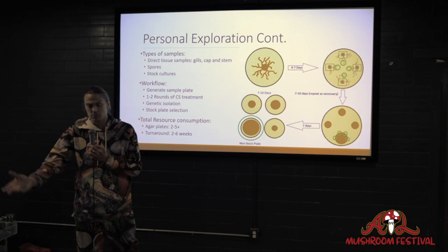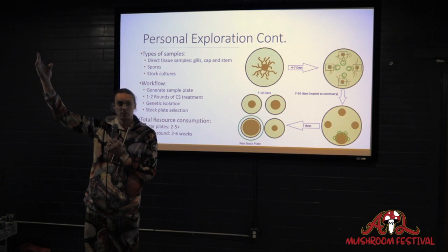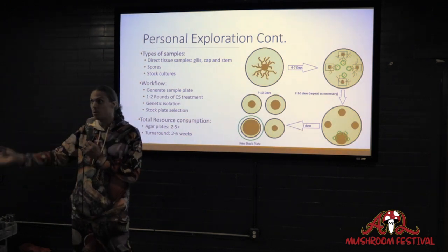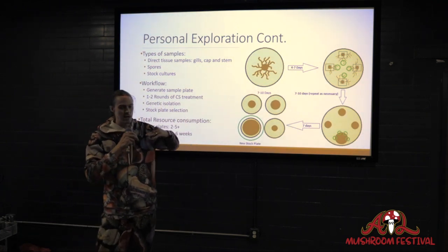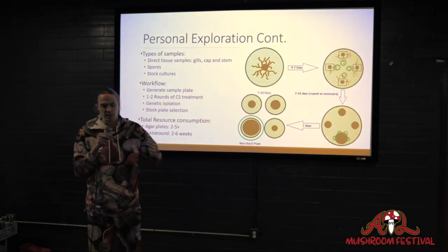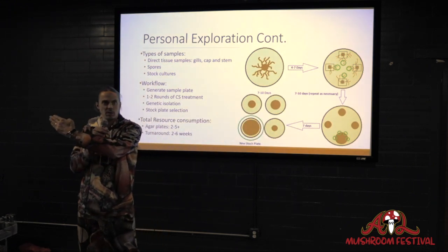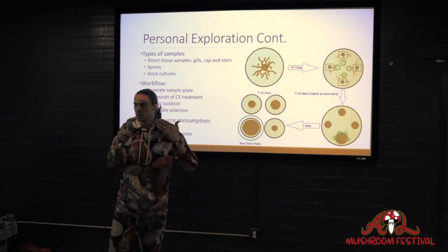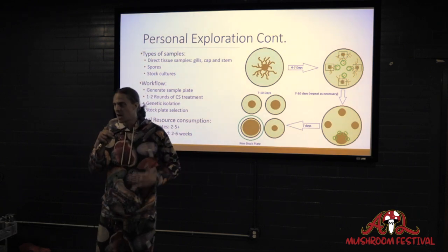So if you're using dextrose as a sugar, as a nutrient, it's definitely seen that before, but it probably hasn't seen peptone or yeast extract or whatever other, light malt extract. There ain't no malt in the tree. So you're essentially having to train it to recognize, hey, you're in a new environment. There's new food here. It'd be like transplanting someone from one country and moving them to the other side of the world and giving them food that they have never eaten before, right? You would have to start by slowly introducing things and then changing the gut flora and then being able to ramp up to have a full meal diet.